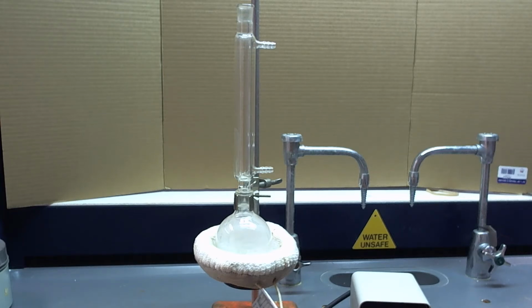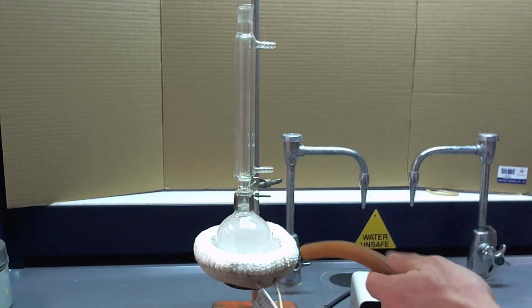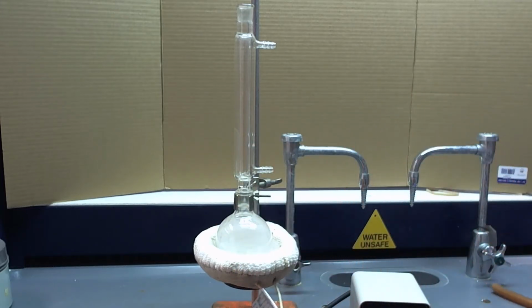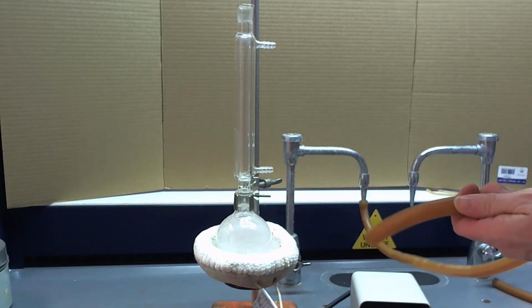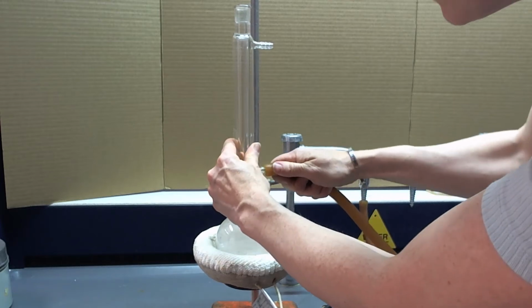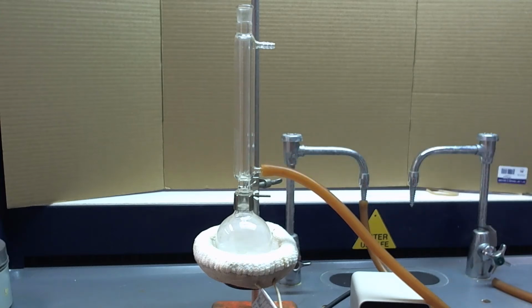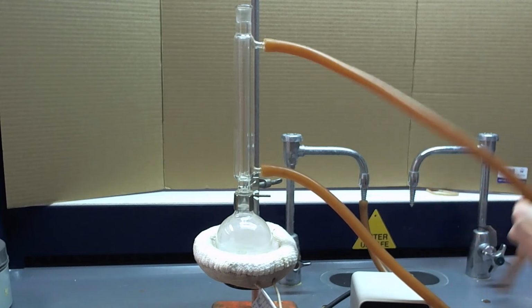So we need 2 tubes. Okay? If you have tubes of different lengths, you want to take the shorter one and connect to the faucet, like so. So cold water will go from the faucet, and then you want to go into the lower joint of the reflux condenser. The water will be forced to go up, up, up, up, up the jacket, and then take your second tube and put it down the drain.